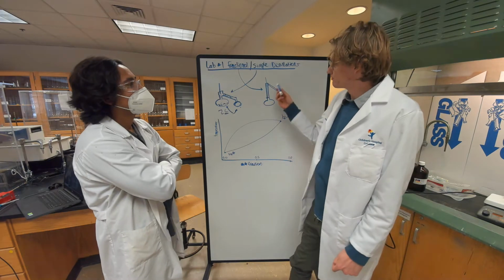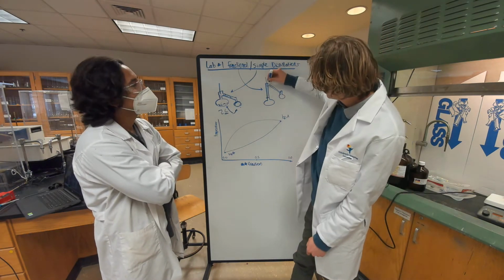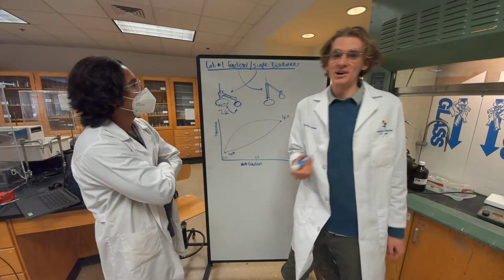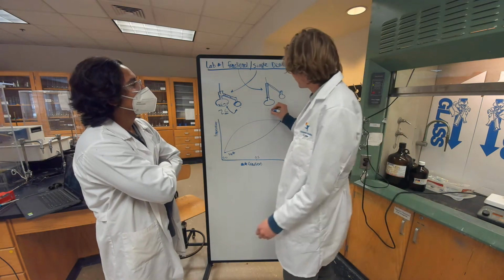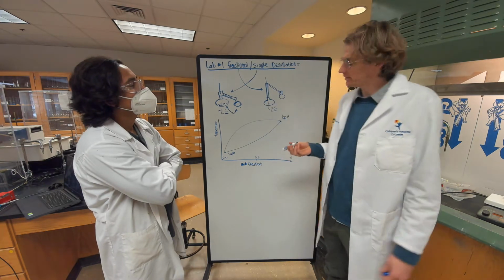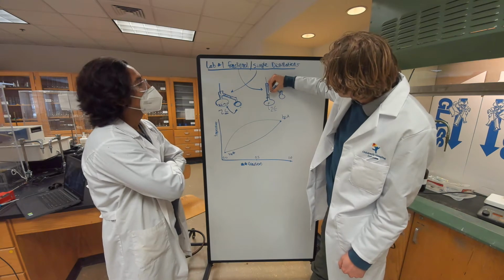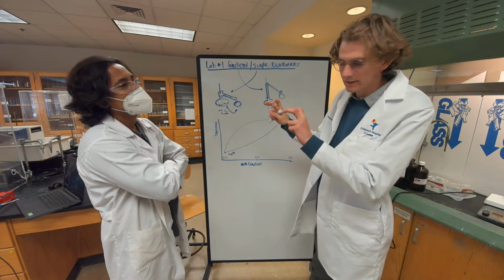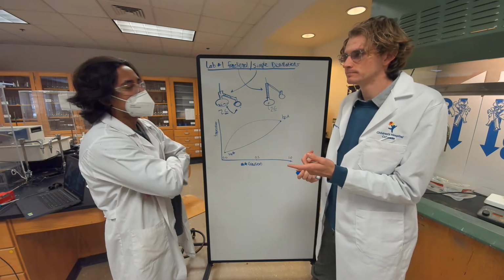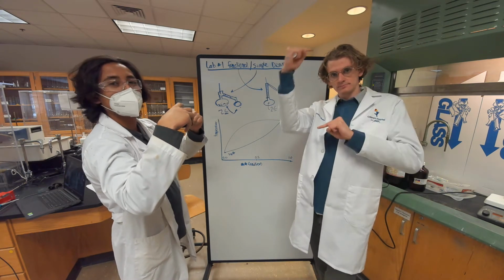On the other side, fractional distillation is a little bit more complicated, but it's actually not. It's basically just a whole bunch of micro simple distillations all happening in what's called a vigreux column. You have multiple liquids in the original chamber, and you apply heat to it. In our case, we're using a tube or condenser with different cross sections of glass inside.